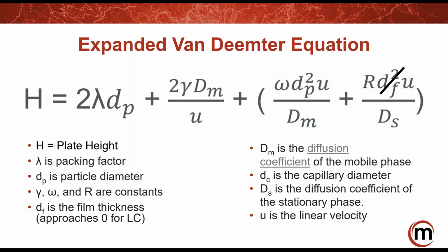And because small molecules, what we're talking about here, or mid-sized molecules, transfer in and out of the particle pretty fast, the C term is really not that big of a play. So that sort of gets minimized. And then you can say, oh, well, the B term in liquids doesn't really diffuse that much. So now you're left with that being minimized. And so you're really left with the height equivalent to a theoretical plate being equal to 2 times the packing factor times the mean particle size.